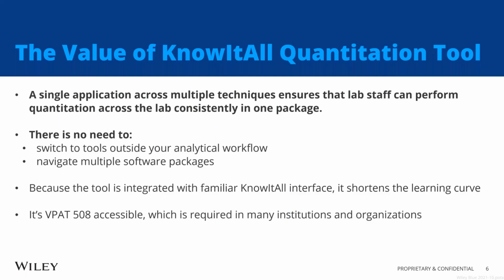So the value of KnowItAll Quantitation tool, a single application across multiple techniques, ensures that lab staff can perform quantitation across the lab consistently in one package. So researchers often find themselves navigating multiple software packages. KnowItAll's quantitation tool eliminates that need. With quantitation, there is no need to switch to tools outside of your analytical workflow. There's no need to navigate multiple software packages.